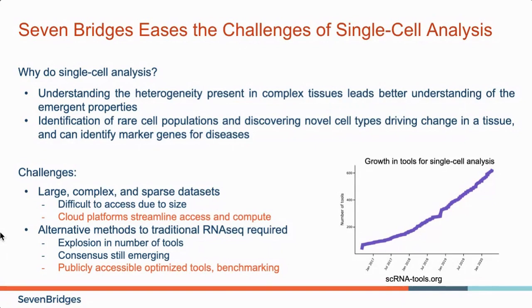So looking at, for example, cancer stem cells can give you a much better sense of how cancer progresses. And by looking at things individually, you can get greater insights from the smaller populations that are likely driving the true biological changes, like, again, for example, cancer stem cells. And you can also use these insights to identify potential marker genes for therapeutic targets or biomarkers. However, as the pace of single cell research has exploded, there continue to be lots of challenges with them.